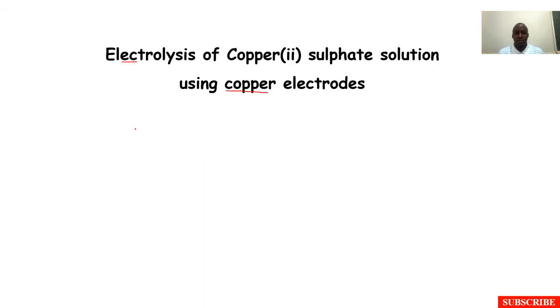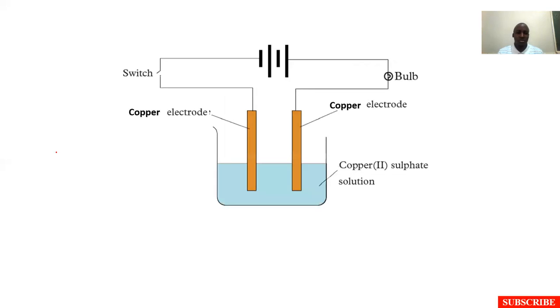During the first version where we used graphite, we saw products being formed — oxygen and copper. But in this case, we want to see what actually happens when we use copper electrodes in copper sulfate solution. When you look at our setup, it is the same, just that in this case we are going to be using our copper electrodes instead of graphite or carbon electrodes.